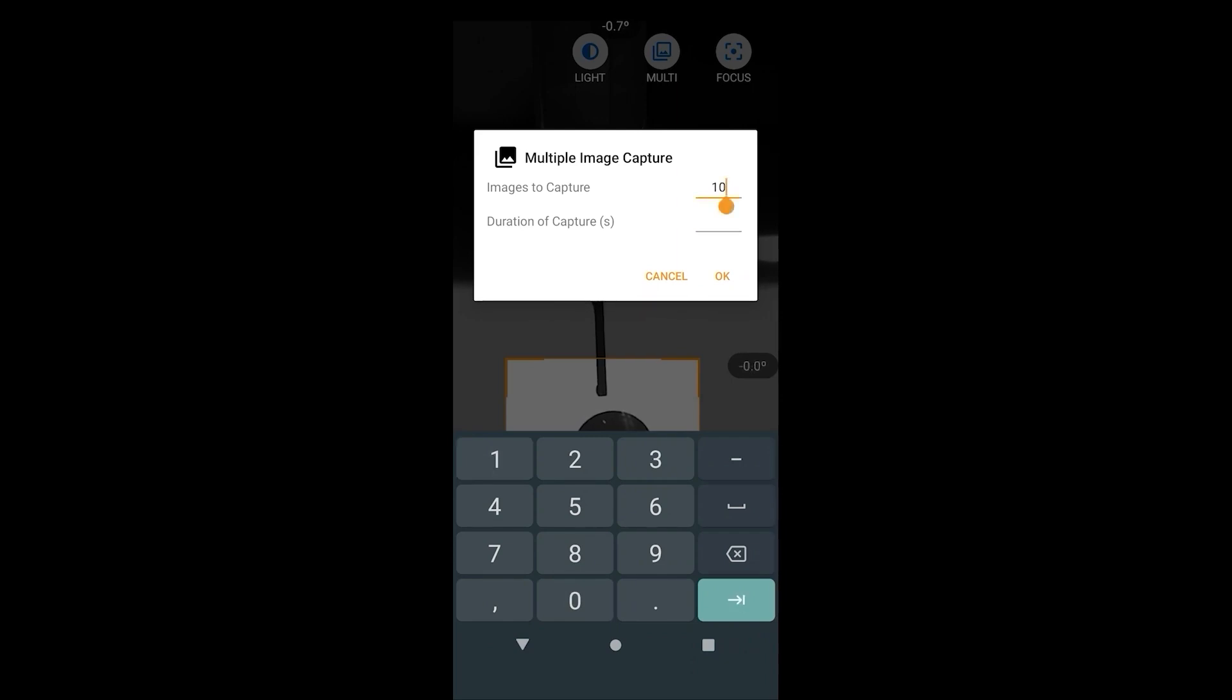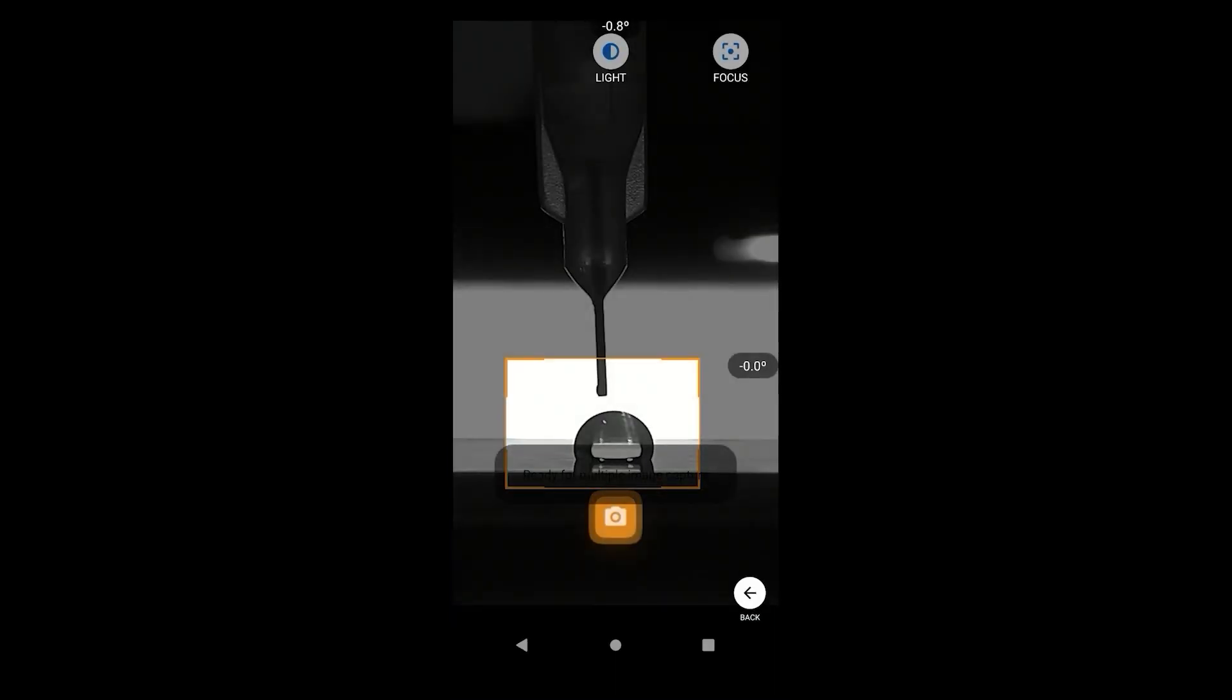Simply specify the number of images to capture in the duration of capture. Once you are ready, hit the capture button and start generating the droplet.